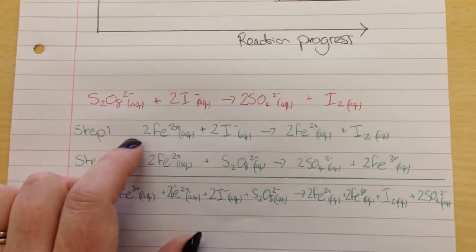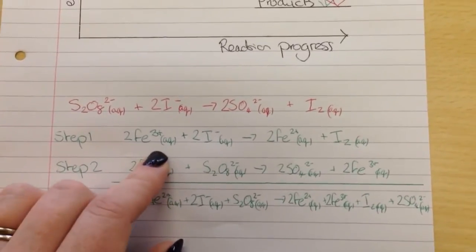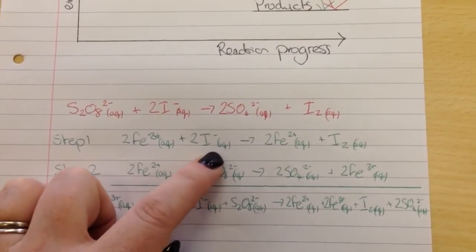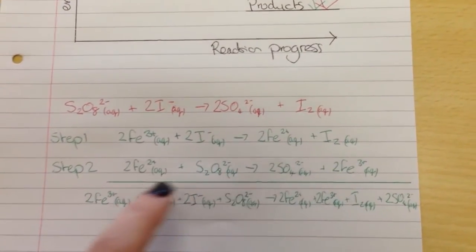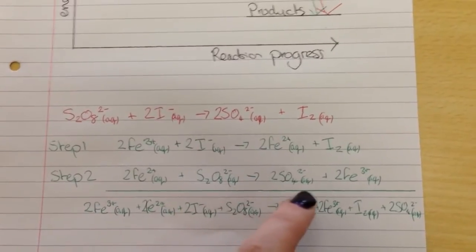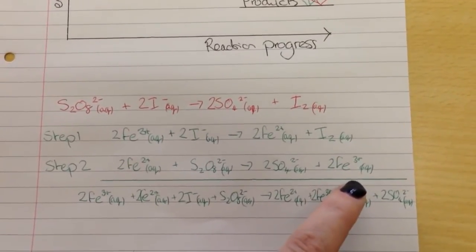So what we do is we introduce iron as the catalyst. So positive three-plus ion is going to interact quite nicely with the iodide ions. And then it's going to come out as a two-plus ion. And then the two-plus ion is going to be returned to its original three-plus state at the end.